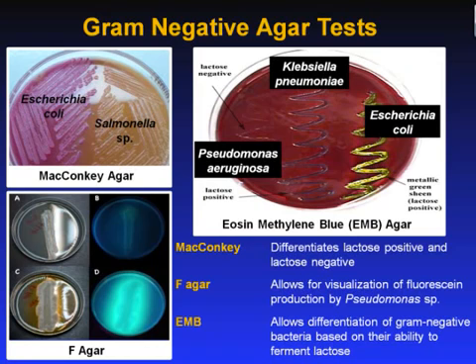The pink color of the bacterial growth in the middle section of the agar indicates the bacterium is able to ferment lactose to produce weak acid end products. This could be an example of Enterobacter aerogenes. Not shown in this photo is absence of growth, which would indicate the organism is inhibited by eosin and methylene blue and is a gram-positive bacterium. An example could be Staphylococcus aureus.